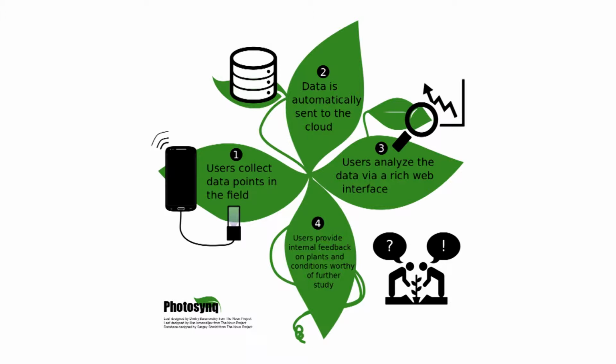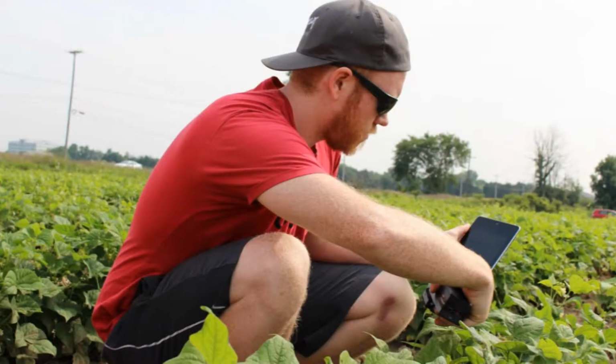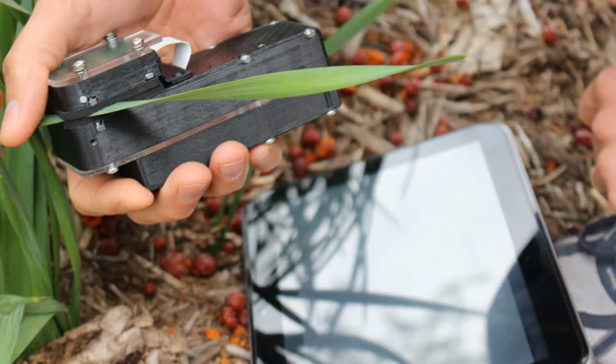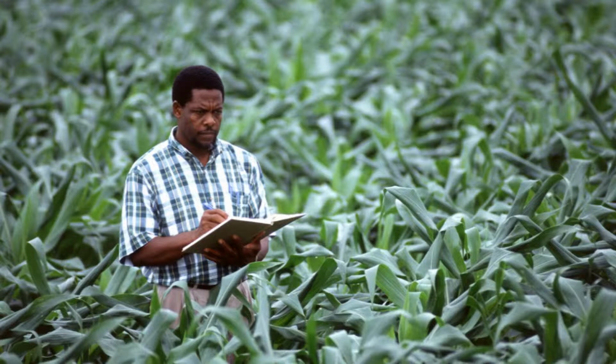You start on the website, you create a project. Within the context of that project, you define the measurements that will be taken, and then someone who has their cell phone sees your project, right? And they say, oh yeah, I want to find the most photosynthetically efficient algae, for example. So they take part. They follow your directions. They take a sample according to your protocols, and then the data goes back to you. So the idea is that ideas go out and data comes back.